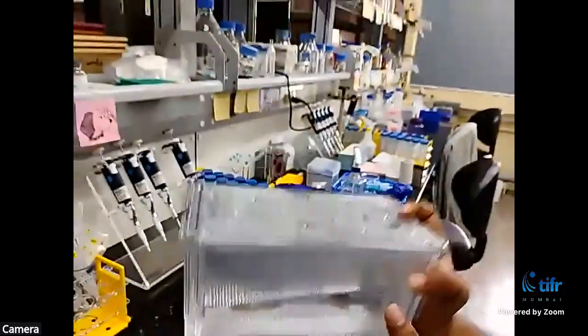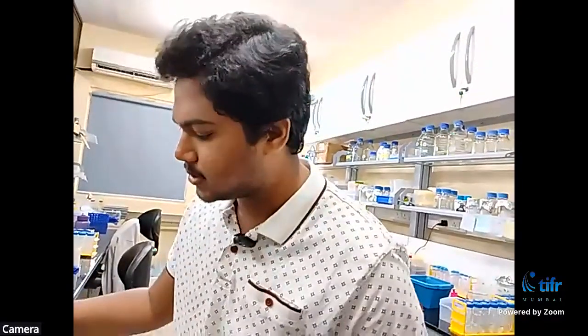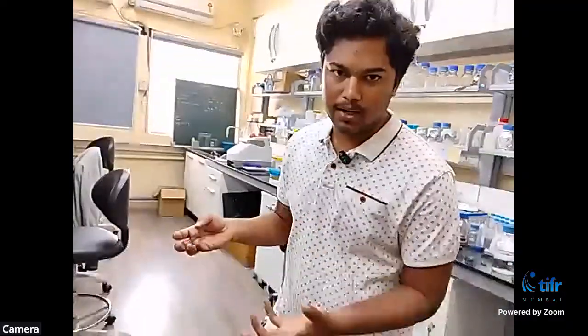Then, as I previously told you, we introduce one male and a female into these breeding tanks the previous day we want the embryos, and we let them have pheromone exchange overnight, and as soon as they receive the first shine of light, they start mating. That is, the female releases the eggs outside in the water, and they are fertilized by the male.